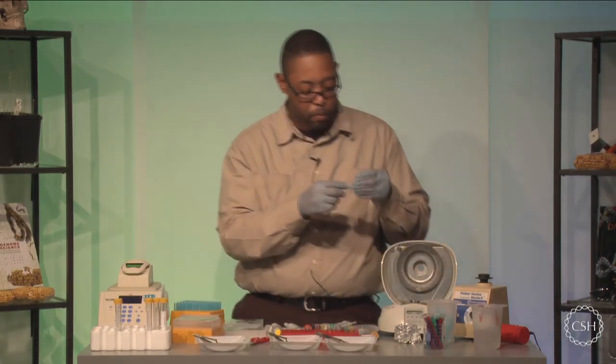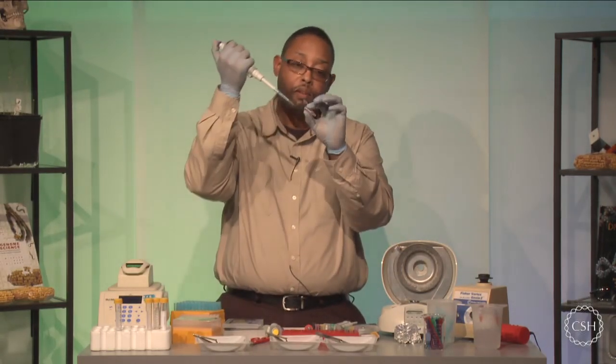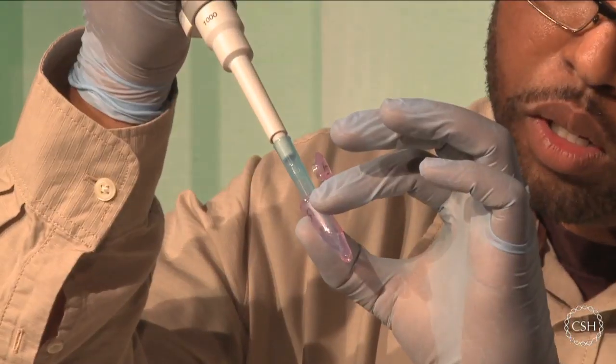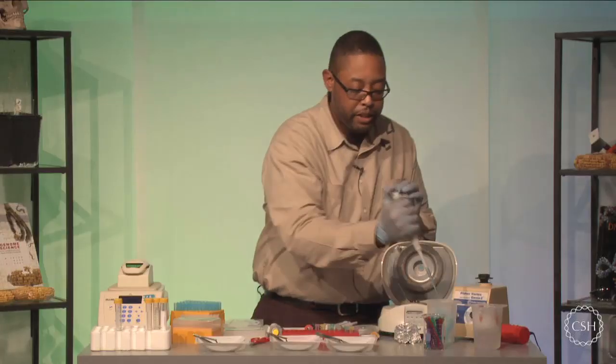So I'm going to take sample number 1, and what I want to make sure of is that I go in there with my large pipetter, draw off all the liquid as much as I can get. Remember not to disturb the pellet.